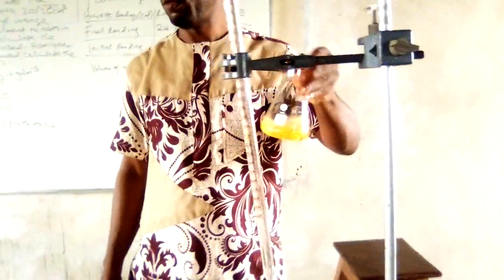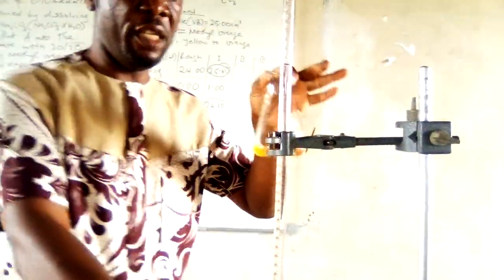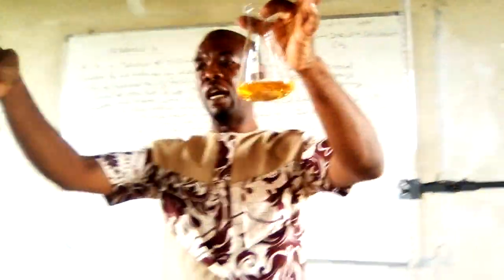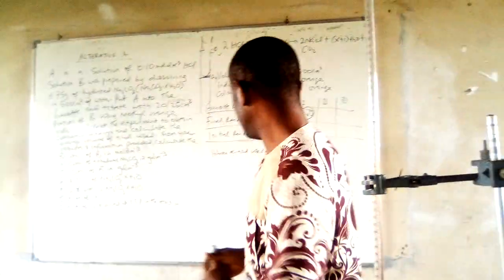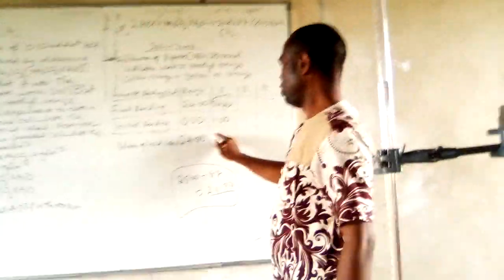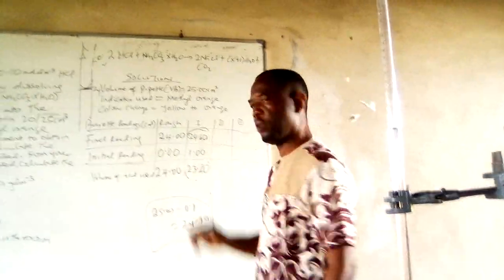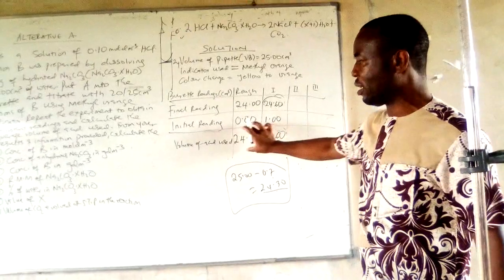Okay. You see? Orange color. Why the first color? First one. You see, compare the two of them, they are the same kind of color, orange. So, 24.6 here now. So, probably you have 23.6, I estimate now. So why is this first one lower than this?